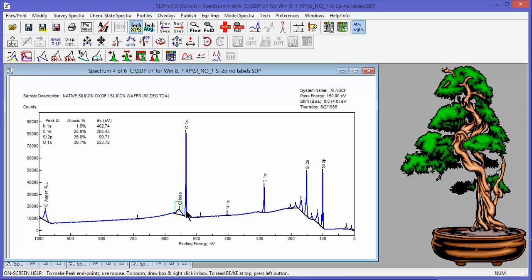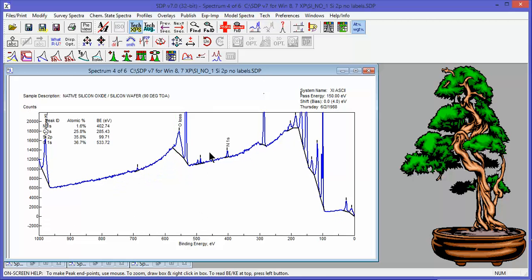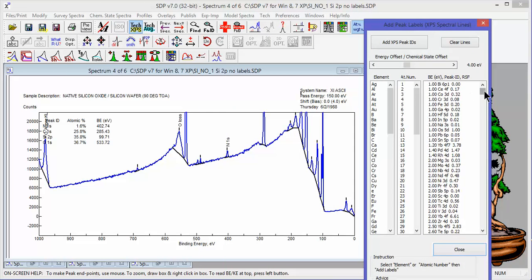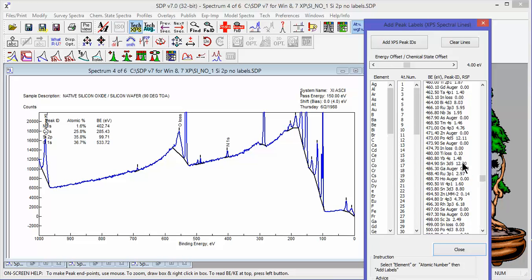Okay. Now this is a weak little signal. It's a doublet. What kind of doublet typically appears around 488? I forget. So I go to the spectral lookup lines table. I go down here to about 485, and that's in this region.